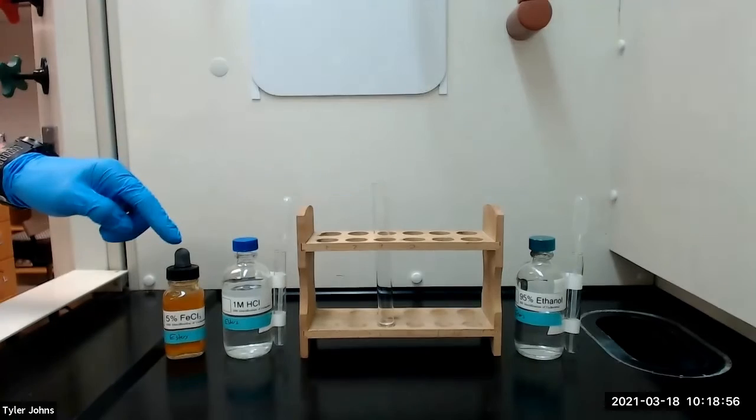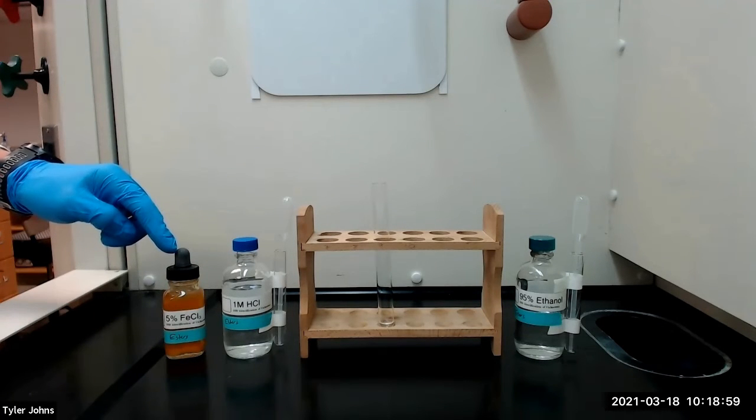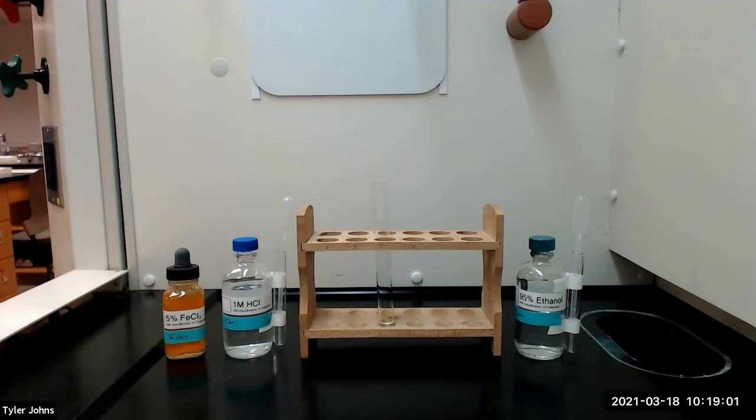We will then add a few drops of 5% ferric chloride solution. A positive test will give a deep burgundy, magenta, or reddish brown color.